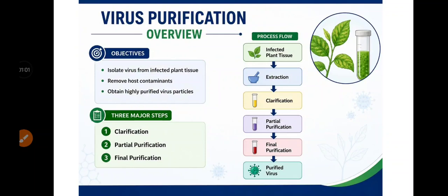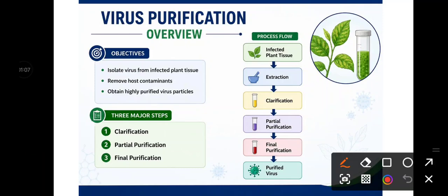So, virus purification. The objective of purification is to isolate virus from infected plant tissue. After extraction, what we got is the crude virus extract, so the host contaminants need to be removed. And why are we doing the purification? To obtain highly purified virus particles.